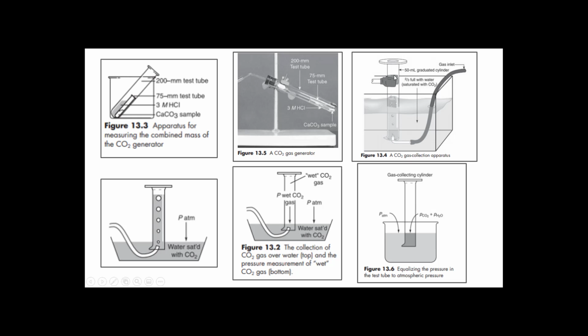And the graduated cylinder, as you can see, is held in place. Now, the problem with this is none of these pictures show that the water has to be completely to the top with no air bubbles. If you have air bubbles, the answer is going to be wrong. You are already having bubbles or gas in place where water should be. So there's already a displacement, which you cannot have.